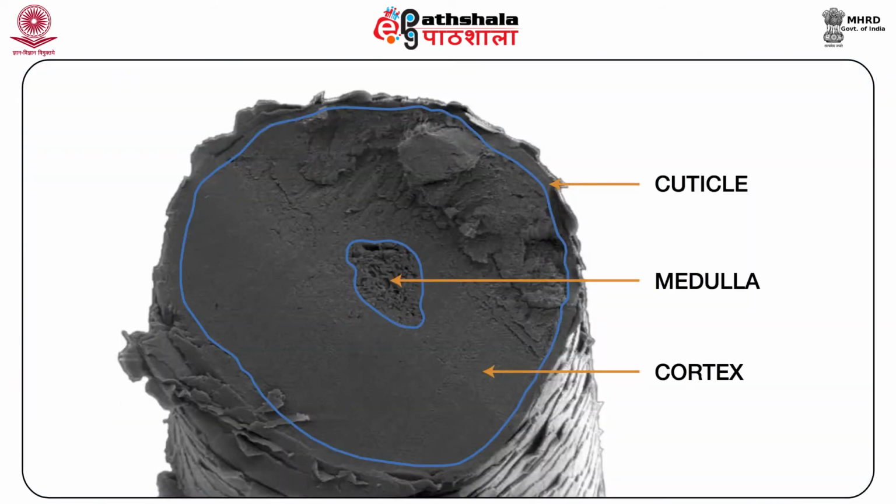Next, we will study the microtomy. The cross sections of hairs are obtained with the help of an instrument called the microtome. Clean hair is embedded in hard wax, plastics or flesh hardened by special treatment, and sliced. The cross sections obtained are placed on a microscope slide treated with albumin. The embedding material is removed with a suitable solvent and the sections are fixed in Canada balsam.